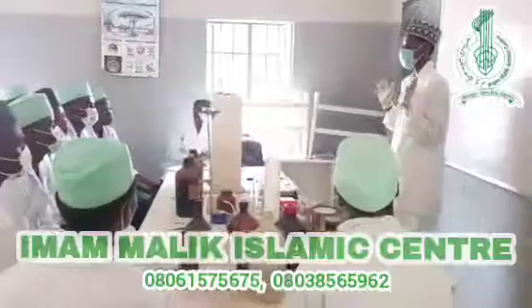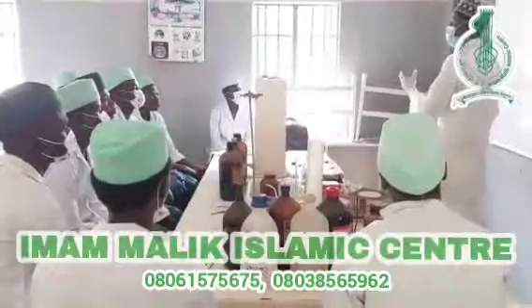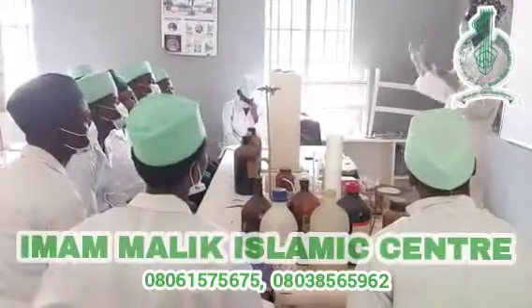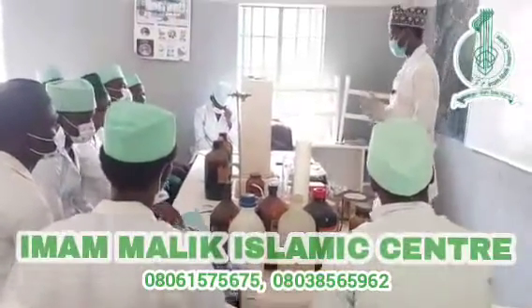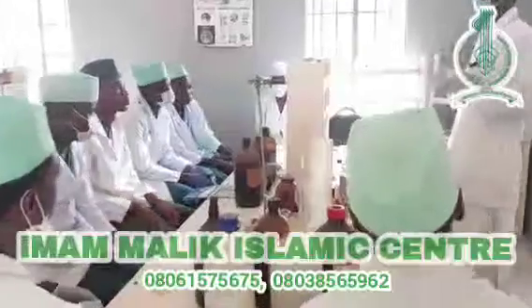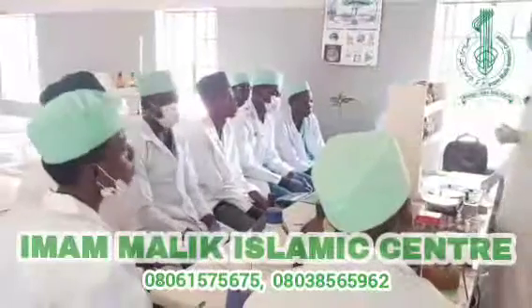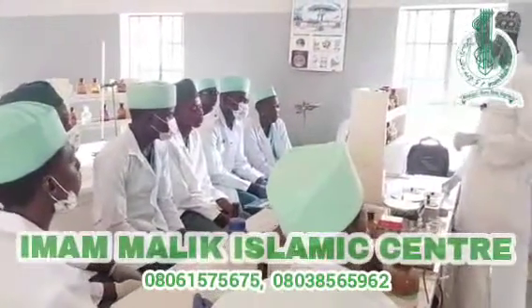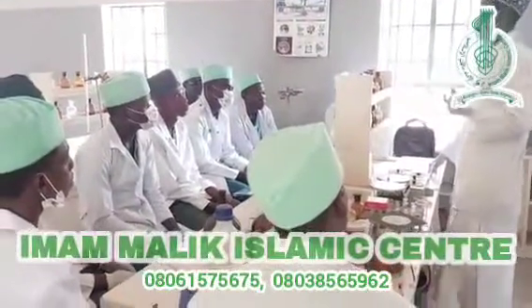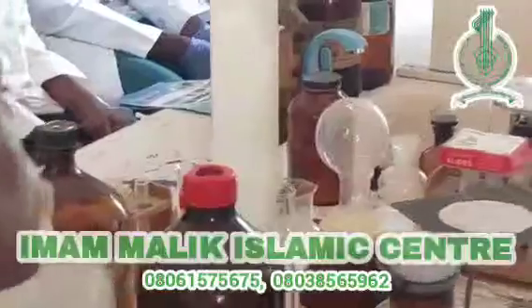So this fume cupboard is where you keep all these toxic chemicals, because it tends to absorb all the fume that will be coming out of the chemicals. It does that so that it should be less toxic to our health. So as with the radioactive elements, these are the potential hazards that as a student or any experiment worker you may tend to be exposed to. So let's see how we reduce all these hazards.